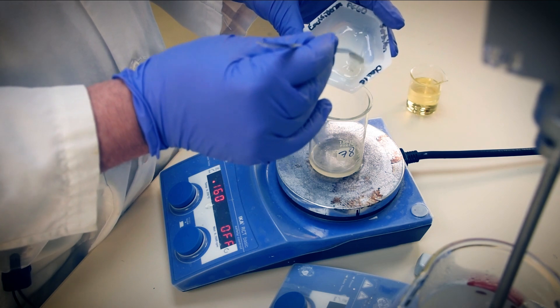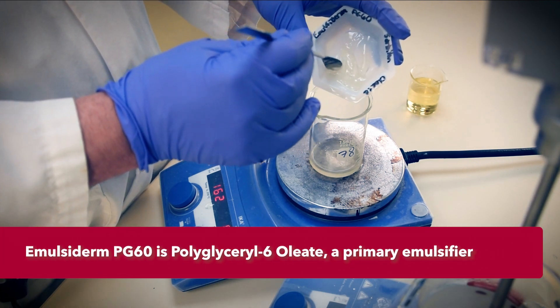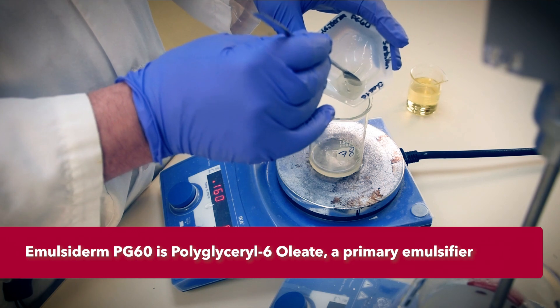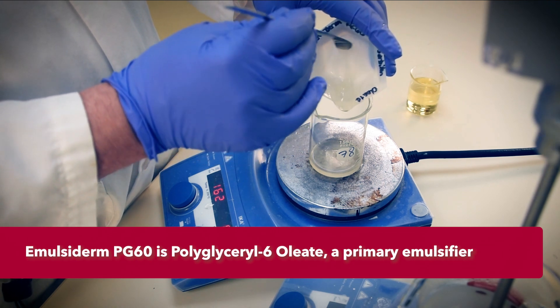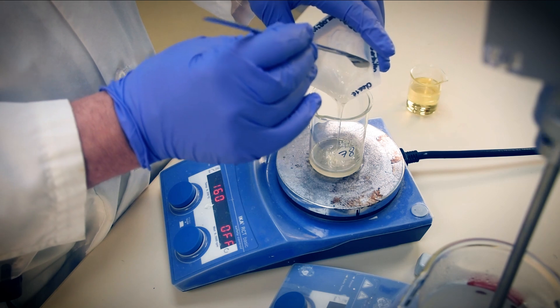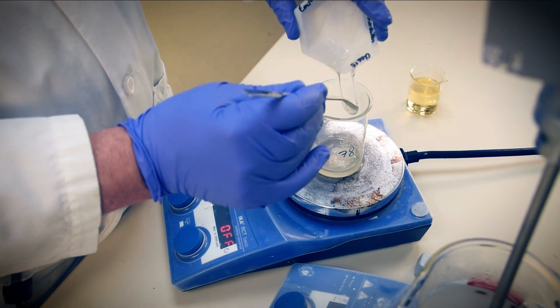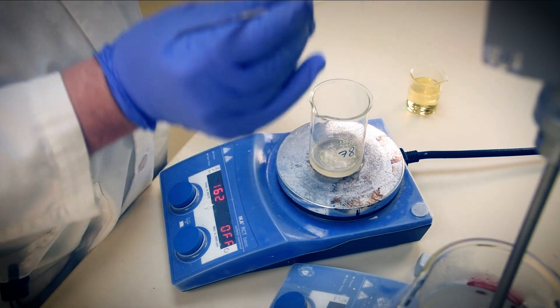For our phase B, let's begin with our primary surfactant emulsifier, Emulsiderm PG6O — polyglycerol-6 oleate. This PEFA is teamed up in a buddy system with the secondary emulsifier, sorbitan oleate. Adding the effect of the polyols, we create a robust emulsifying system for lotions and creams based on renewable resources.